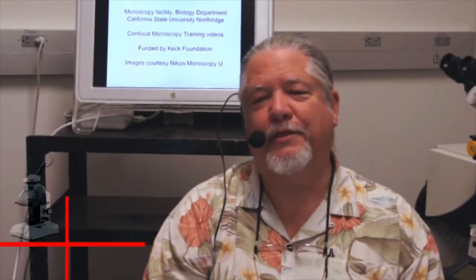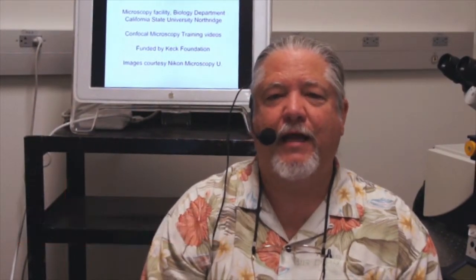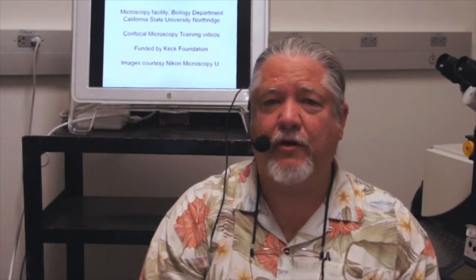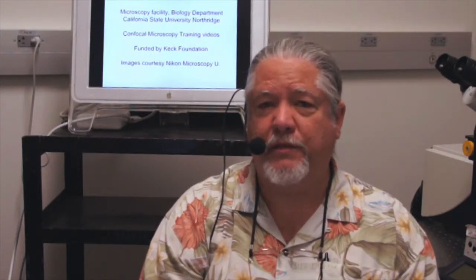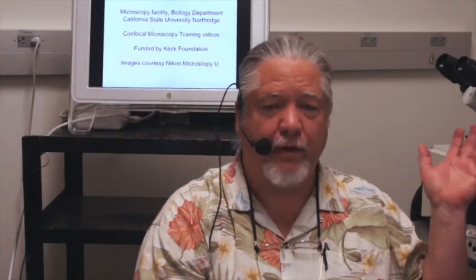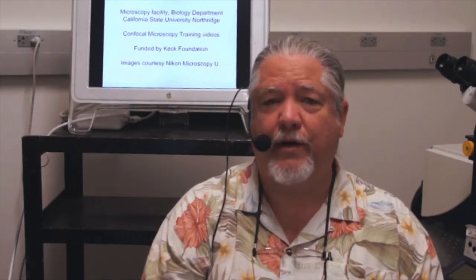Hello, this is Mark Armitage speaking to you from the microscopy facility in the biology department at California State University, Northridge. We welcome you to this series of videos. The purpose of these videos is to train you in microscopy in general, but on confocal microscopy in specific. Behind me you see the Leica SP5 confocal microscope. You're going to be learning how to use this instrument to do your experiments in confocal microscopy.